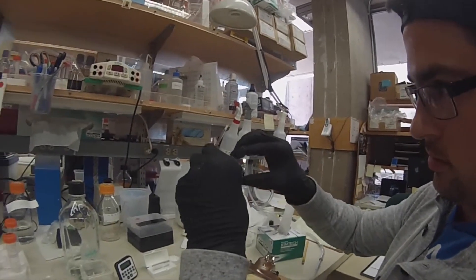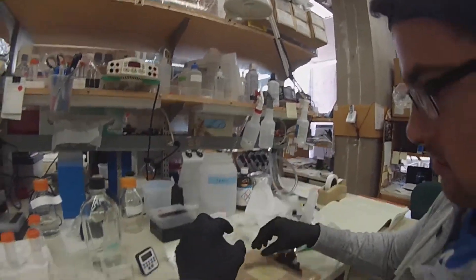Air bubbles can definitely ruin your sample.